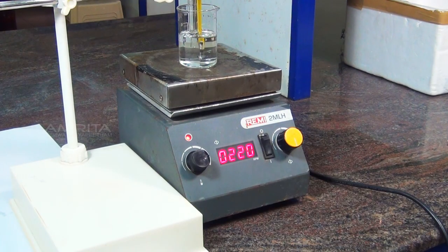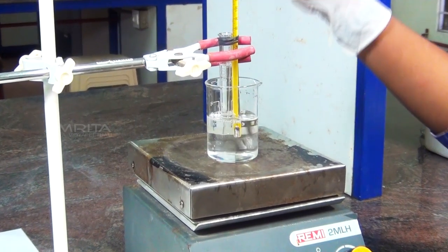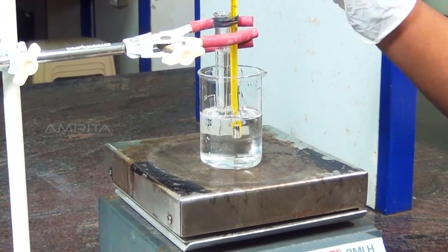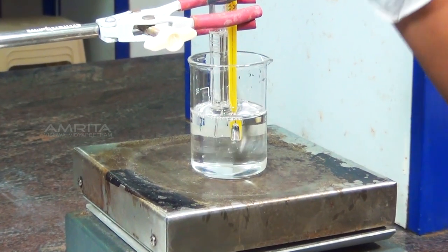Start heating the liquid paraffin bath slowly and stir the bath gently using the stirrer to ensure uniform heating.